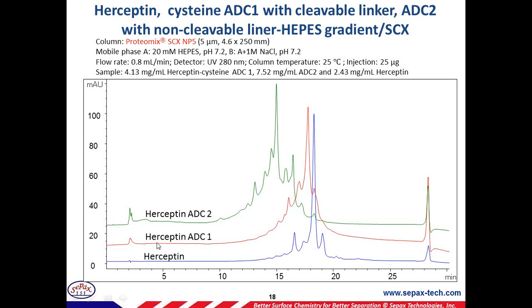In our case, for Herceptin, we actually have a really nice pH gradient for this monoclonal antibody, but we cannot resolve the ADC well, or not as well. In this case we're using a HEPES buffer at pH 7.2. So you can see, it lines up very nicely with the unconjugated main peak, still residual unconjugated mAb in the ADC sample, and all the other different charge variants due to the conjugations of the small drug and the linker chemistry. So sometimes if the linker chemistry has charges, then it may reflect on your charge variance as well. And sometimes in the chemistry portion, you have ring opening and introduce charges. It also will reflect from the cation exchange as well.